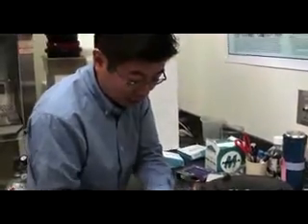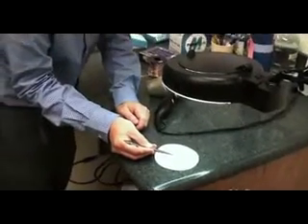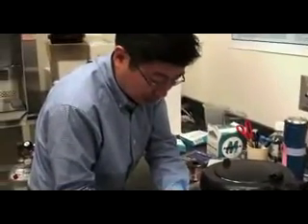But in a collaborative study with other University of Texas colleagues, Liu used the electron microscope to examine quick frozen solutions full of bacteria and viruses. Because when you freeze it, you kind of snapshot, capture some intermediate stage. This is actually one of the highlights of this particular study because we capture this intermediate stage that nobody saw before.